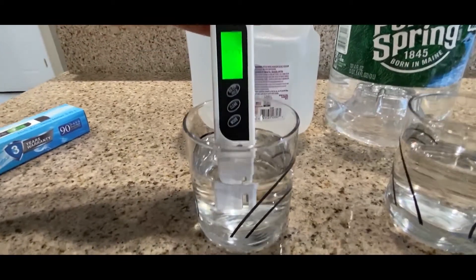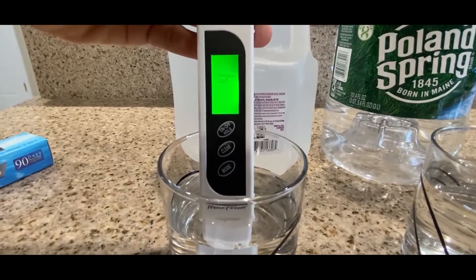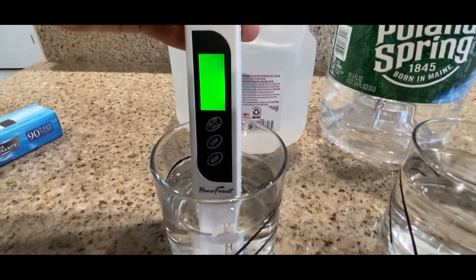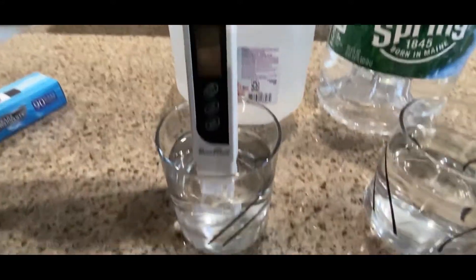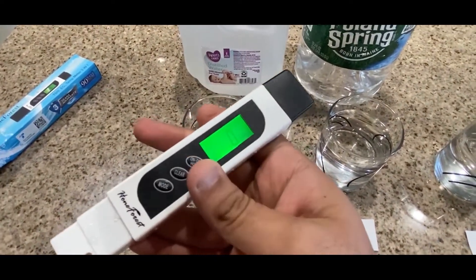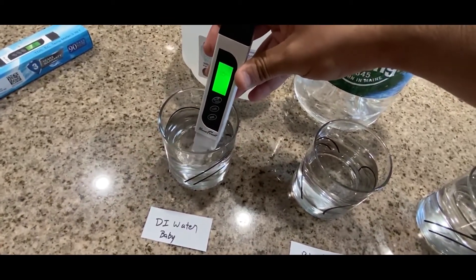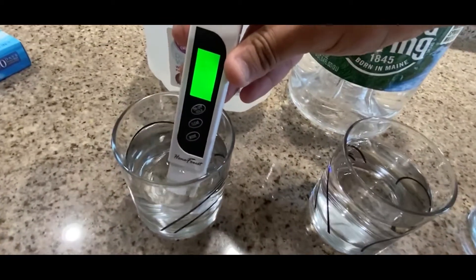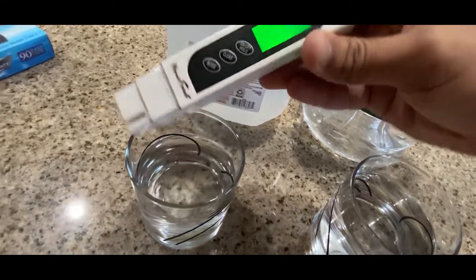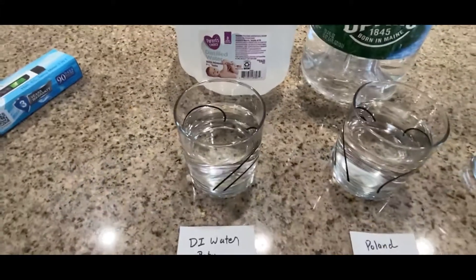The first one is DI water — Baby DI water — and the reading comes out to be 4. Sorry, sometimes the camera angle isn't right, but let me show you one more time. Yeah, there you go — it's 4. Let's move to the next one: Poland Spring.